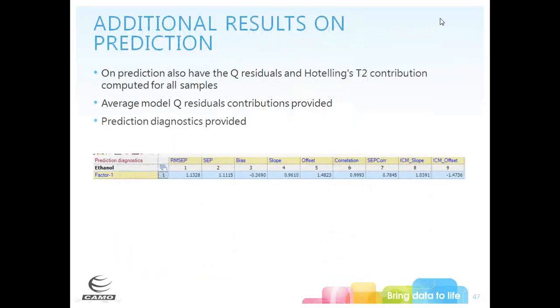There are also additional prediction results in the Unscrambler X. On prediction, you get Q residuals and Hotelling T-squared contributions computed for all samples. Average model Q residuals contributions are also provided, as are prediction diagnostics summarized with RMSEP, bias, slope, offset, and so forth — all accessible in one matrix.